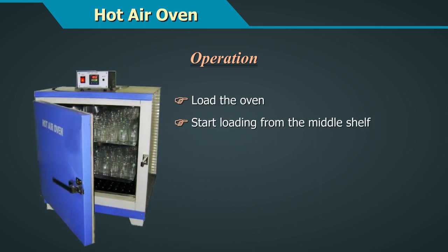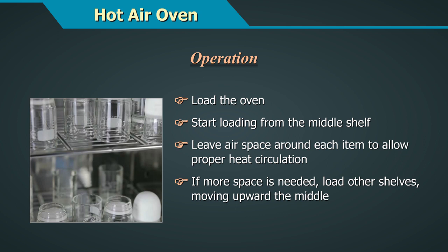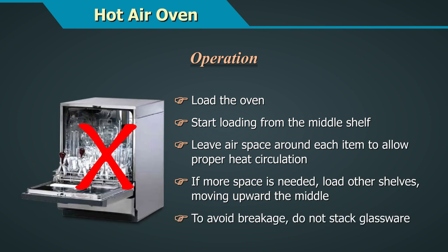Load the oven starting from the middle shelf. Leave air space around each item to allow proper heat circulation. If more space is needed, load the other shelves moving upward from the middle. To avoid breakage, do not stack glassware.